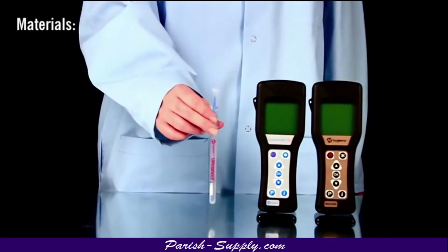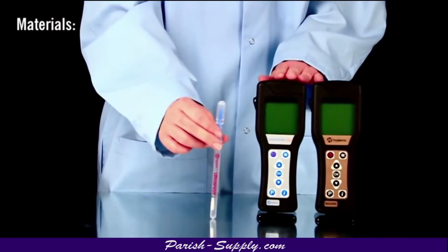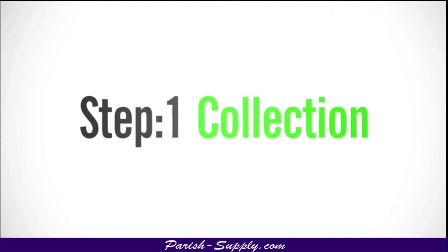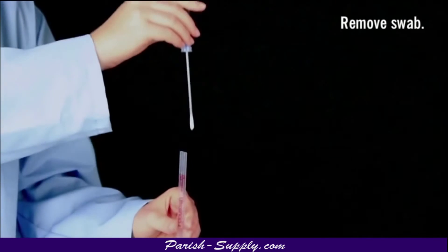The materials you will need include an Ultrasnap test device and either a SystemSure Plus or Insure luminometer. Ultrasnap is a three-step process. The first step is collection. Remove the swab from the tube.